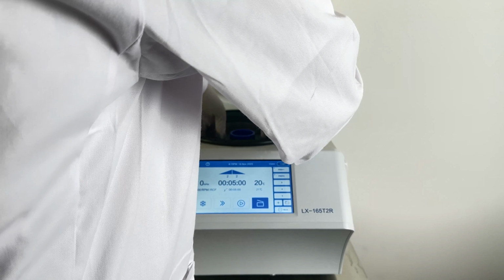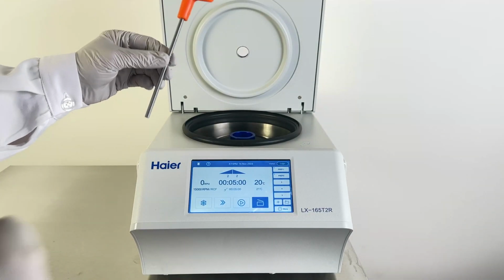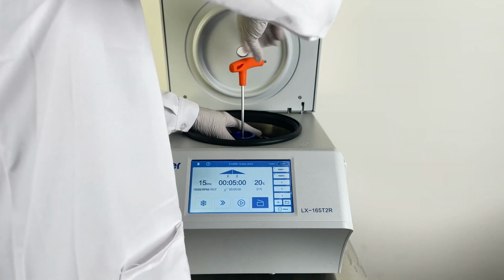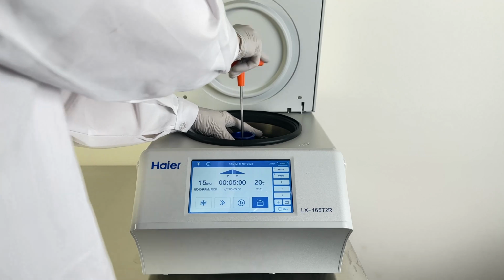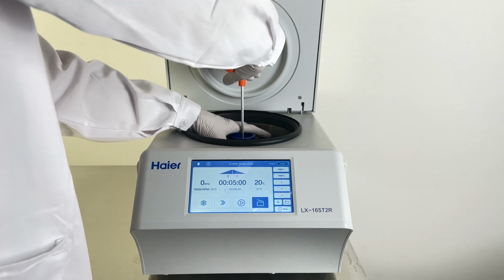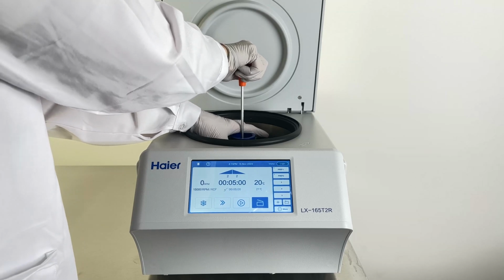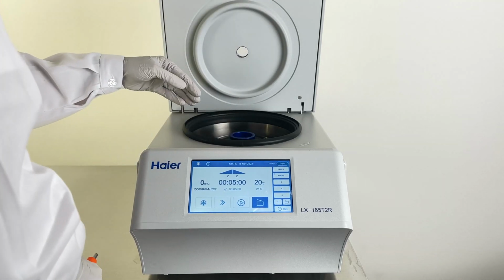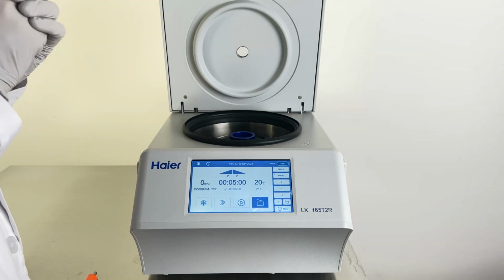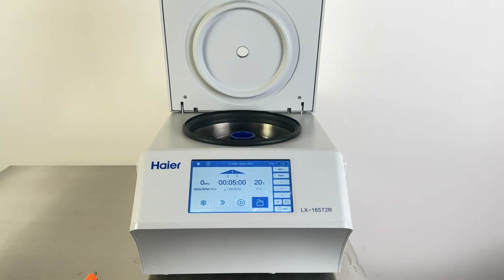So you've set the rotor grooves to 3 o'clock and 9 o'clock, so you can then pick up the rotor, place it on top, you take the rotor key and you tighten it up. And this should be firmly attached. And then always, safety measure, check that the rotor is attached and you're good to go.